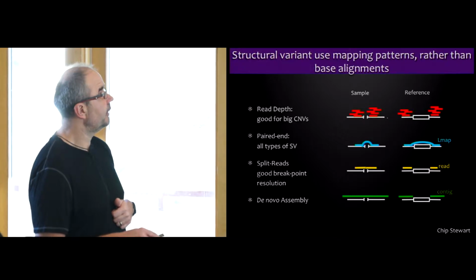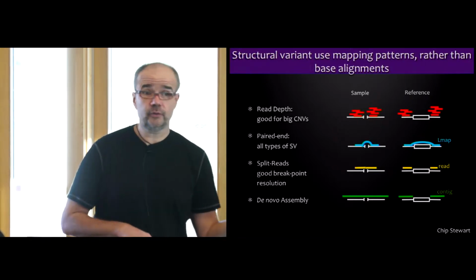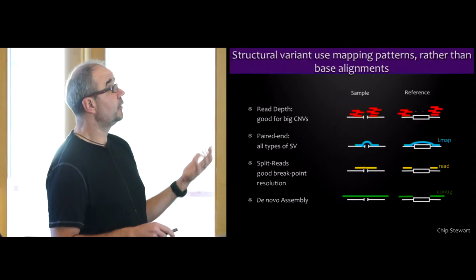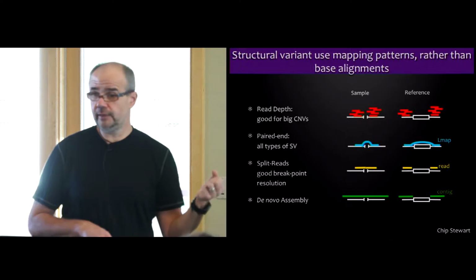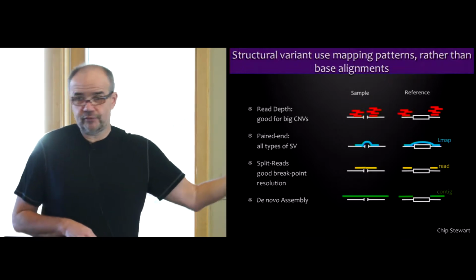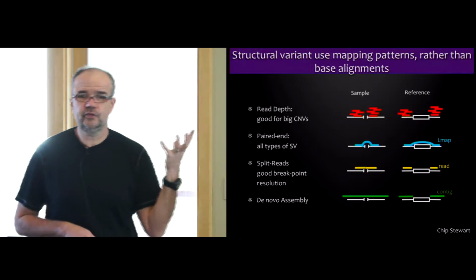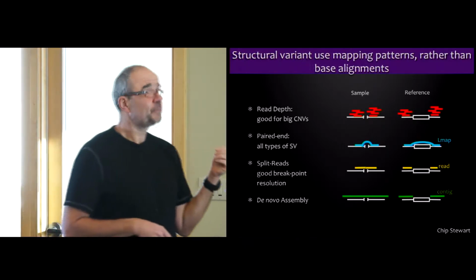This is the reference sequence that has this segment of the DNA that's missing from the individual you're sequencing now. Then the signature that you get is just there's no reads aligning to that region from that sample, right? So it's not that you have reads to detect in that variant because there is nothing aligned there. So you have to use that fact itself. Okay, so that's sort of like the easiest to understand signature of a genetic variant.